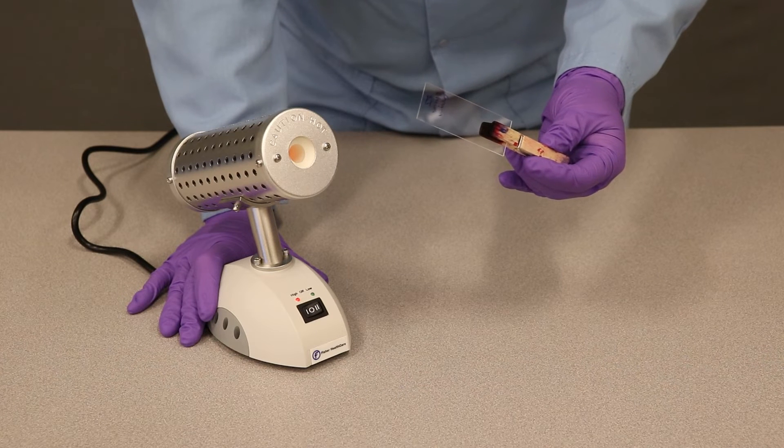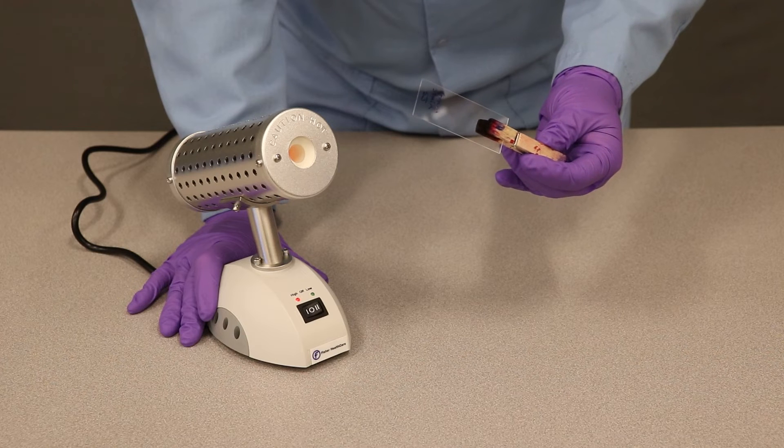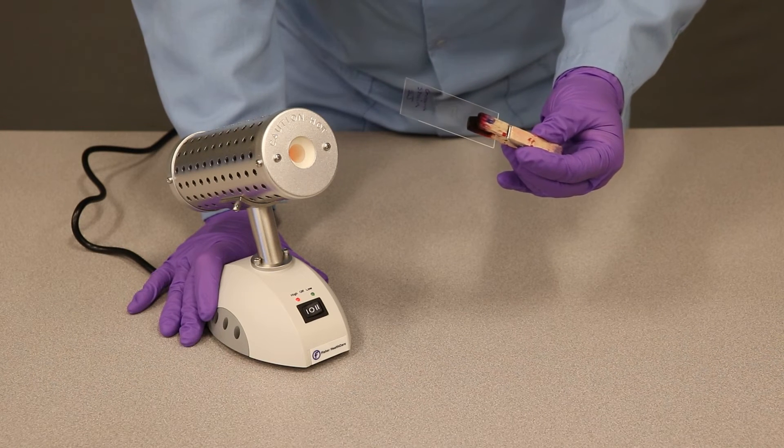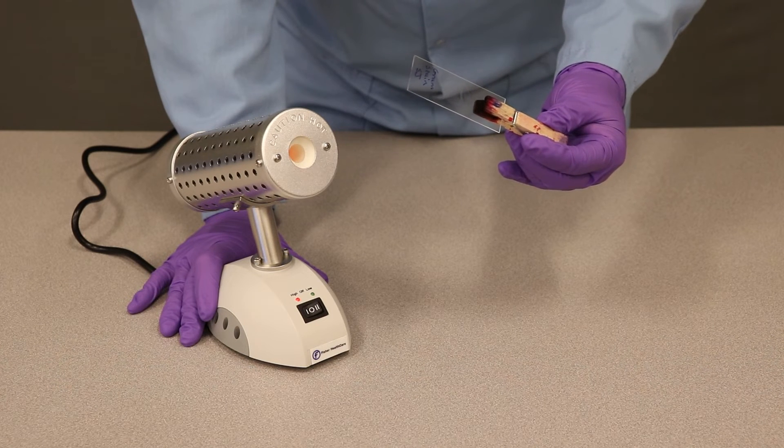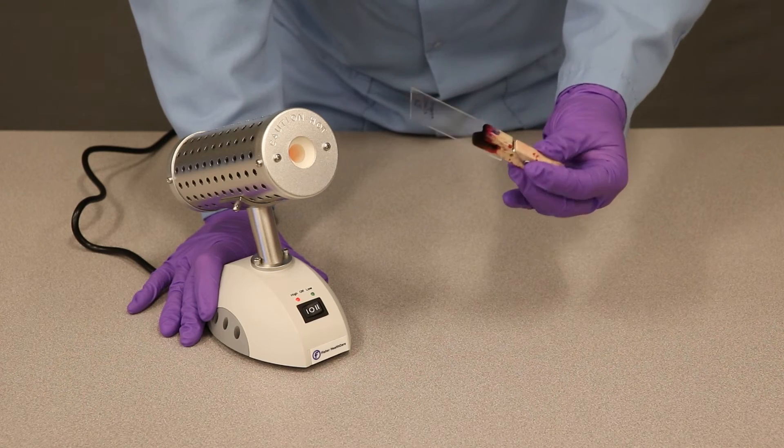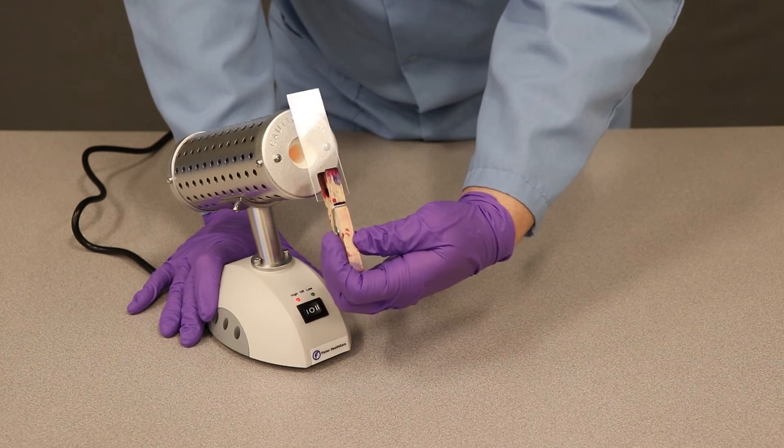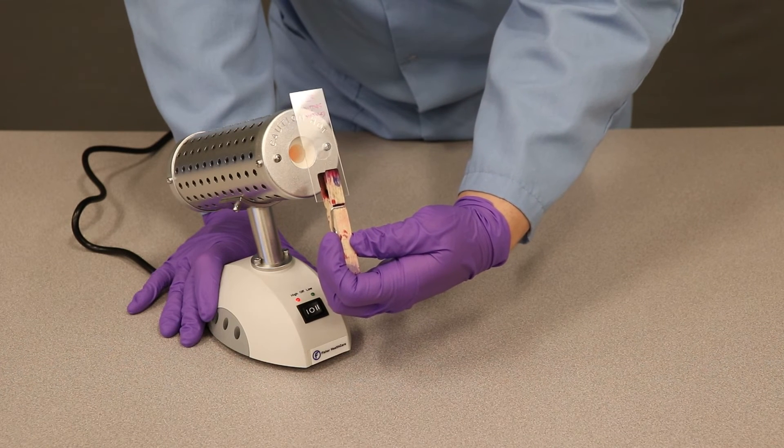Another thing you can use the Bact incinerator for is to heat fix a slide to prepare it for staining. This will be different than when you heat fix using a Bunsen burner because you'll be holding it in the heat for a bit longer than you would for a Bunsen burner. To heat fix, you hold the slide in front of the opening to the mantle and hold it there for about 10 to 20 seconds depending on how thick the smear is.